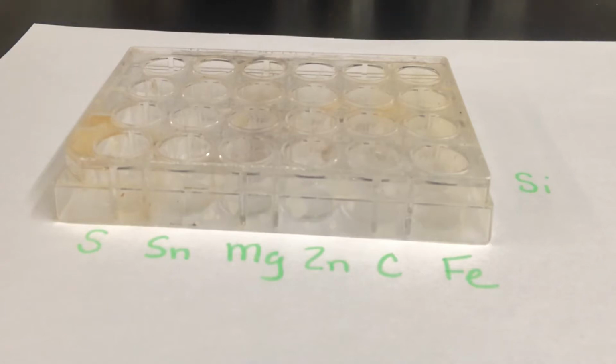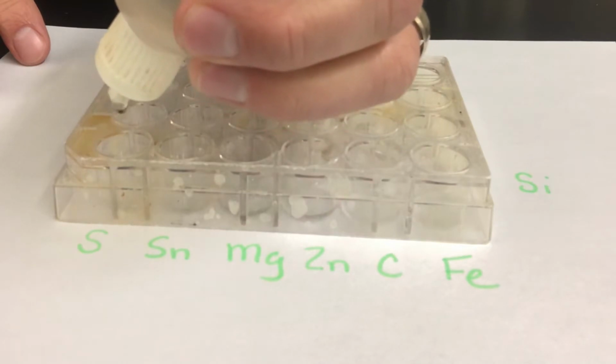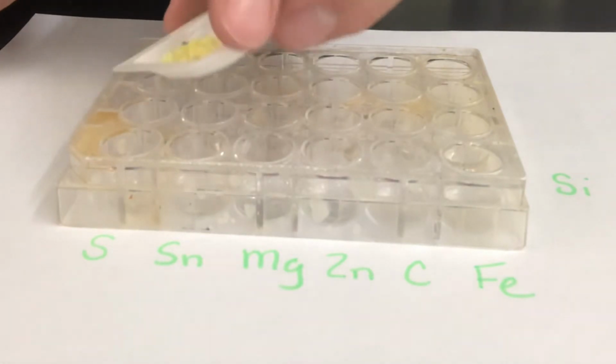This next test is going to be seeing if it reacts with acid or not. So what we will do is we're going to put 20 drops in each of these spot plates. Now that we've added 20 drops in each spot plate, we're going to put a couple pieces of each element.